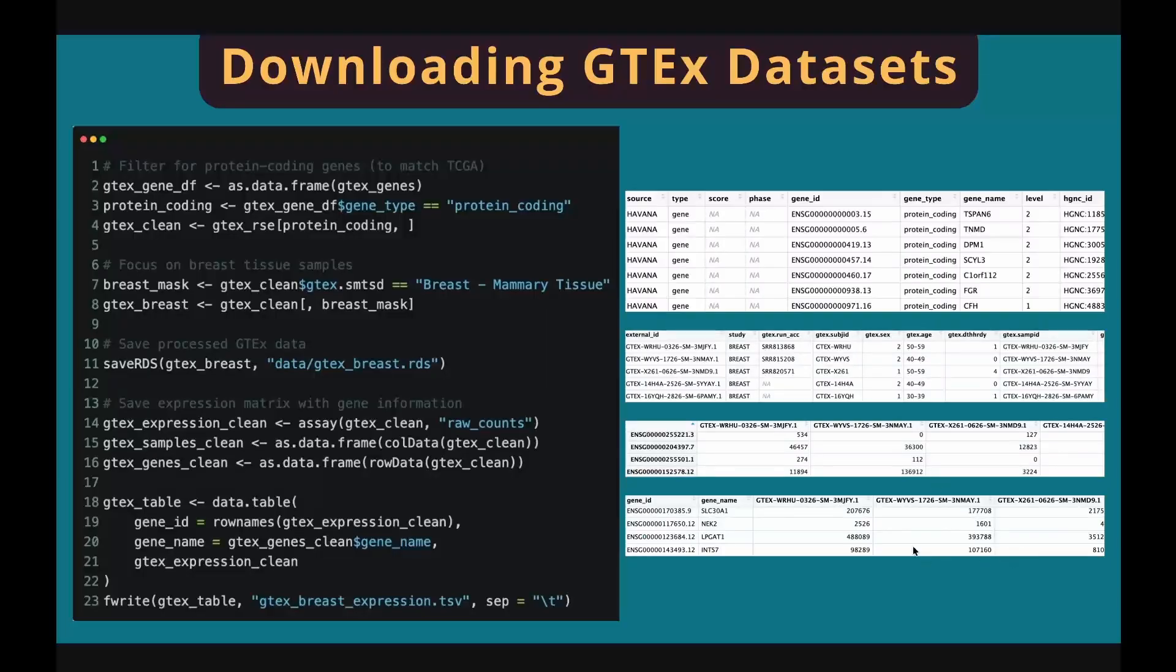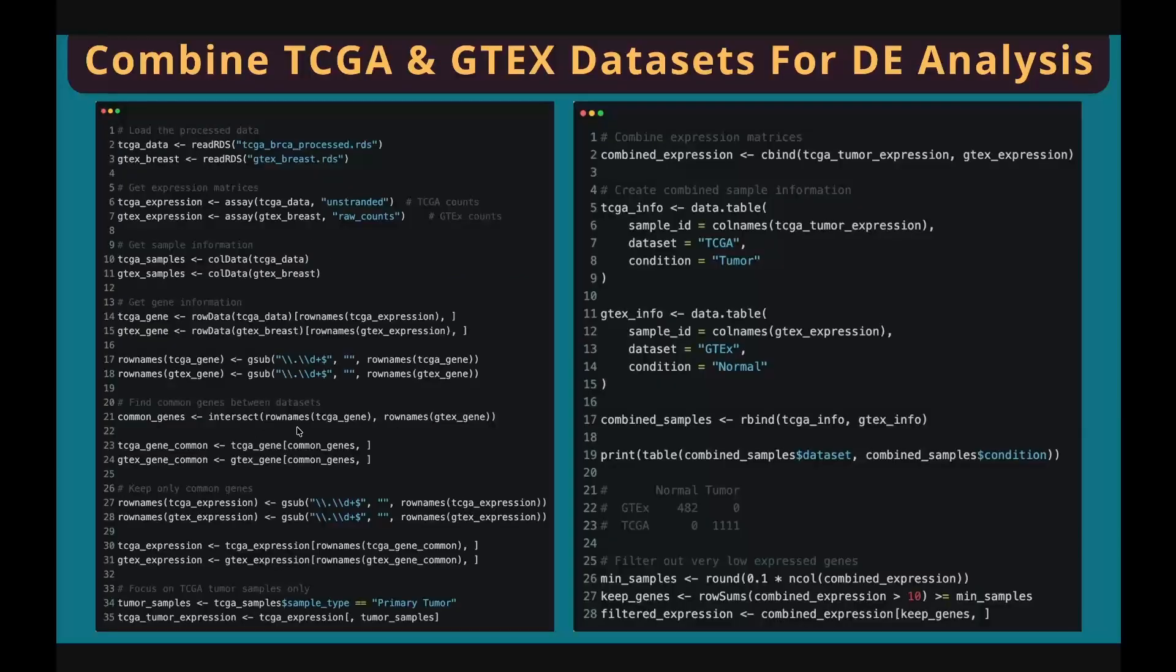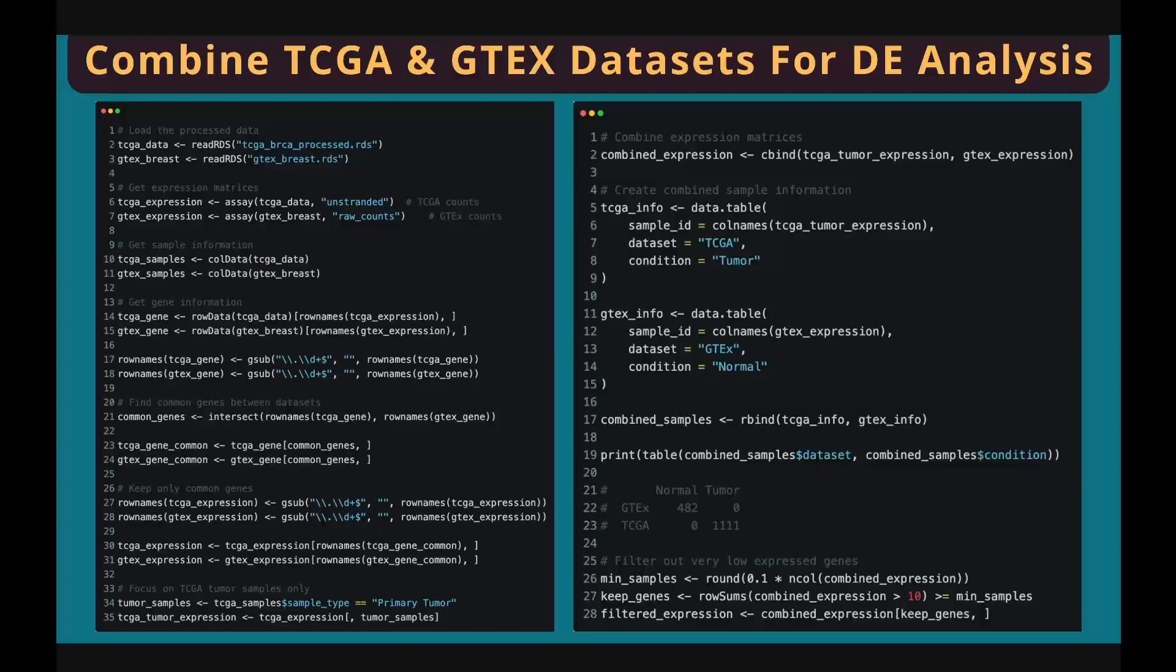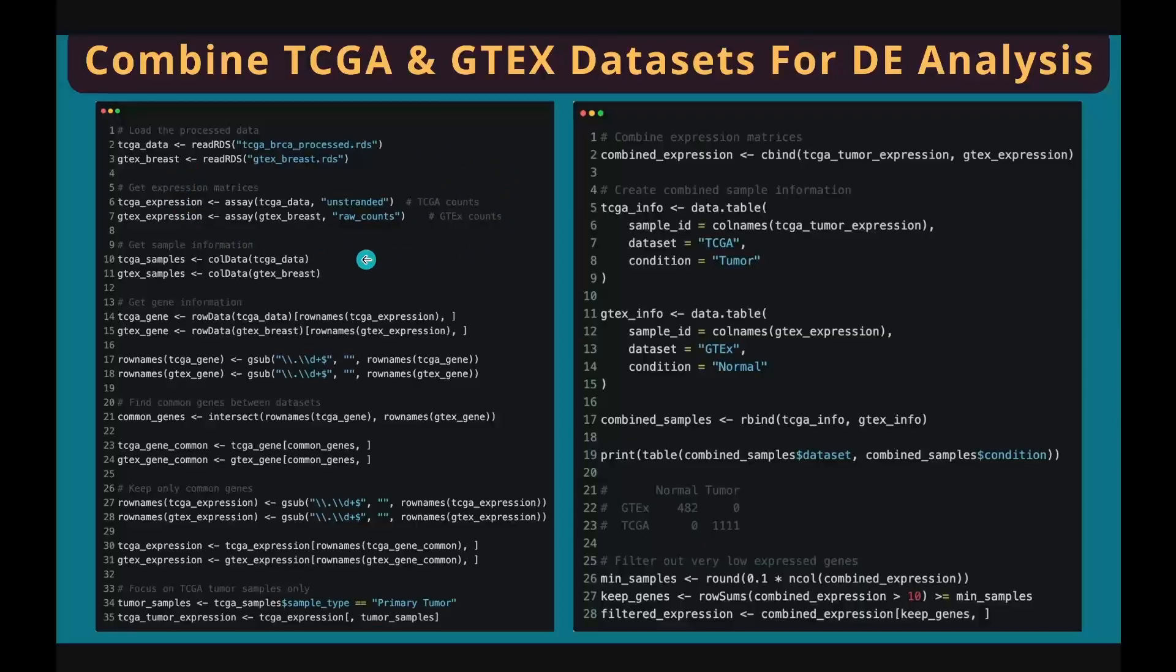Now that we have gene expression data from both tumor and normal samples, we can directly compare the gene expression between the two conditions. Let's start by creating a combined gene expression matrix. First step, read in the R objects from our previous steps. Retrieve the gene expression matrices. Retrieve the sample information. Retrieve the gene information.